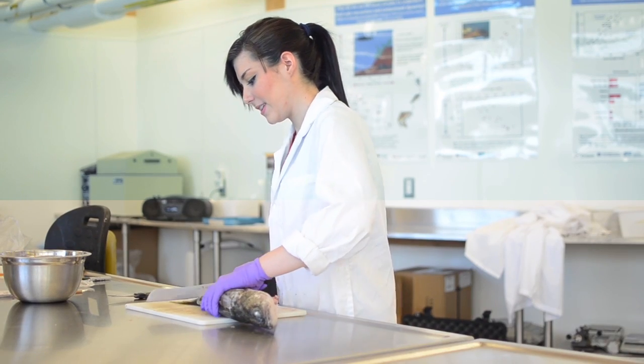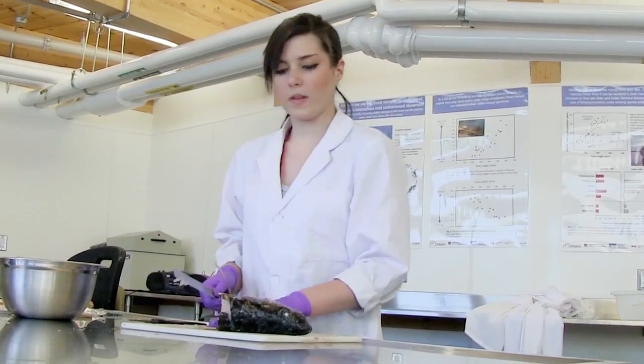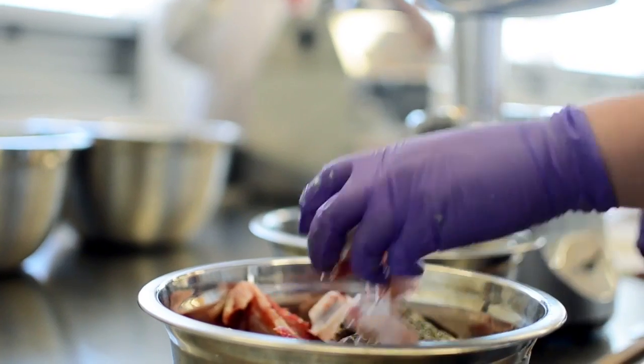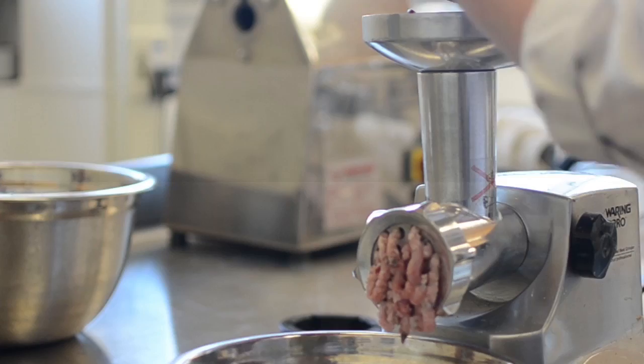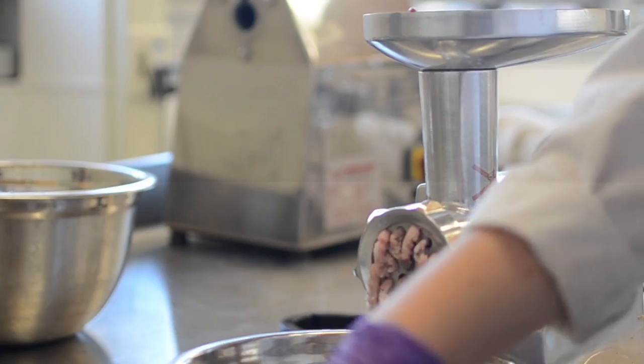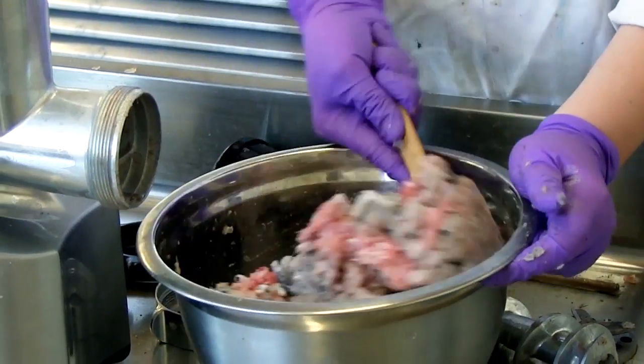First, someone takes the whole fish and cuts it coarsely into pieces with a bread knife. This takes a little patience. The second step is then to pass those fish chunks through an industrial meat grinder three times in order to mix and grind all of the body parts thoroughly. A sub-sample is then taken and frozen for future biochemical analyses.